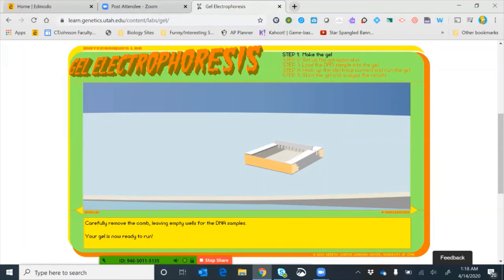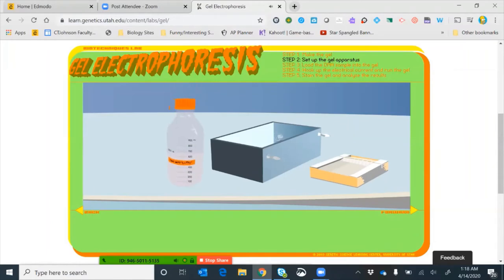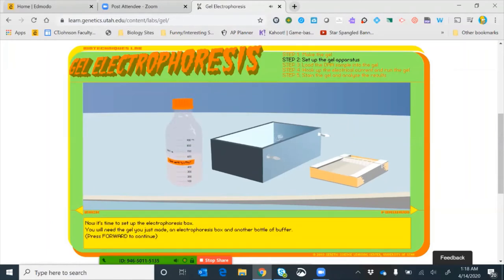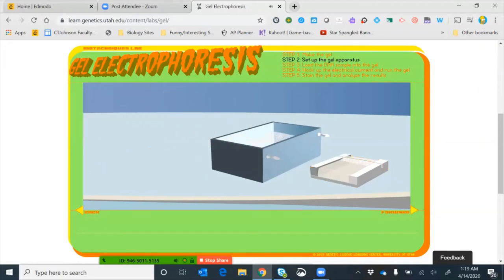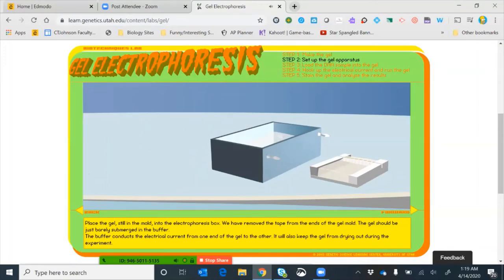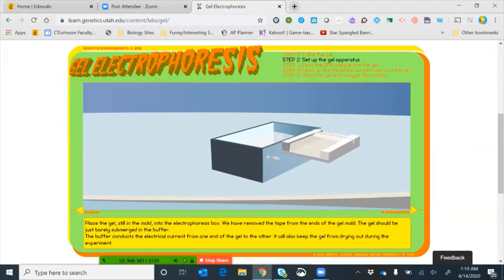Once the gel has cooled, we remove the gel comb so we can see our wells. Now we're ready to set up the gel electrophoresis box. We need more TBE buffer — a salt solution that helps electricity run through the gel — a gel box with electrodes, and our agarose gel. We pour buffer into the gel box, remove the tape from the gel mold, and carefully place the whole mold into the gel box.